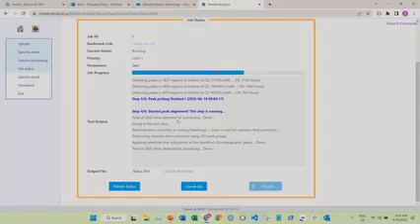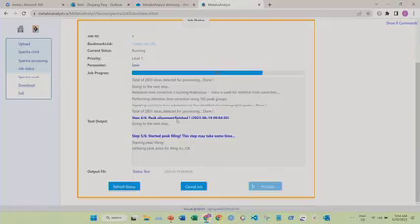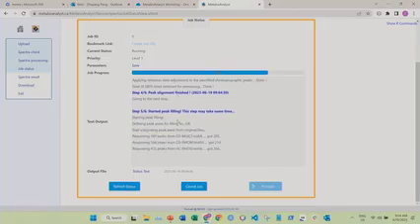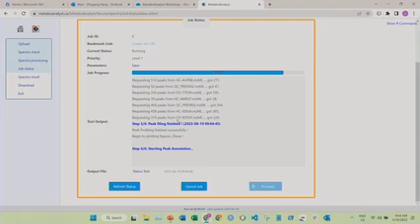You're going to provide a text file that has your sample names and their interpretation, basically the group label. So you can have QC. If it's QC, you must use QC, which is a special term we recognize. We use the pooled QC for doing the optimization, because we found QC has the strongest signal, because it's pooled and has more peaks.